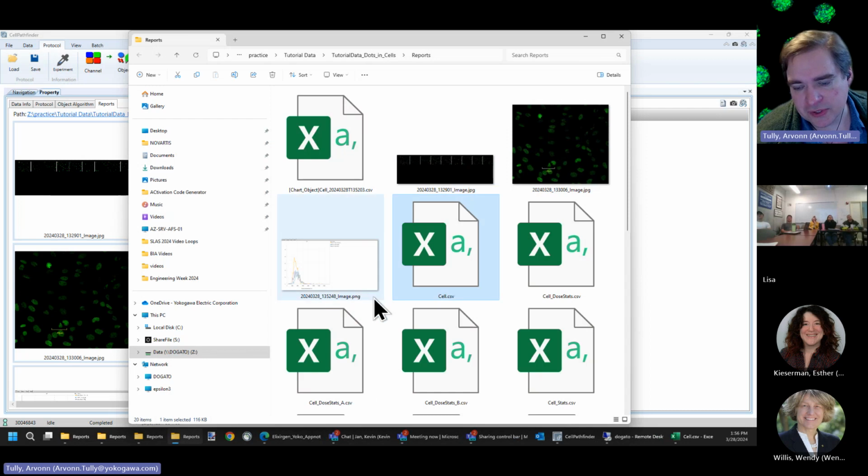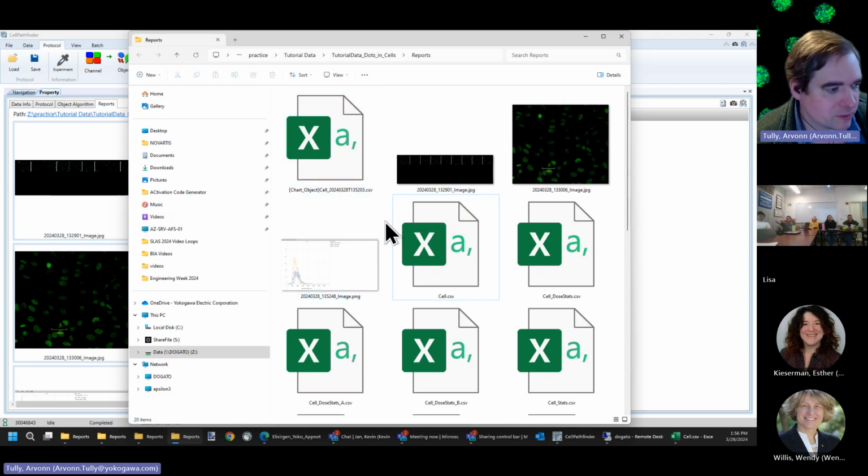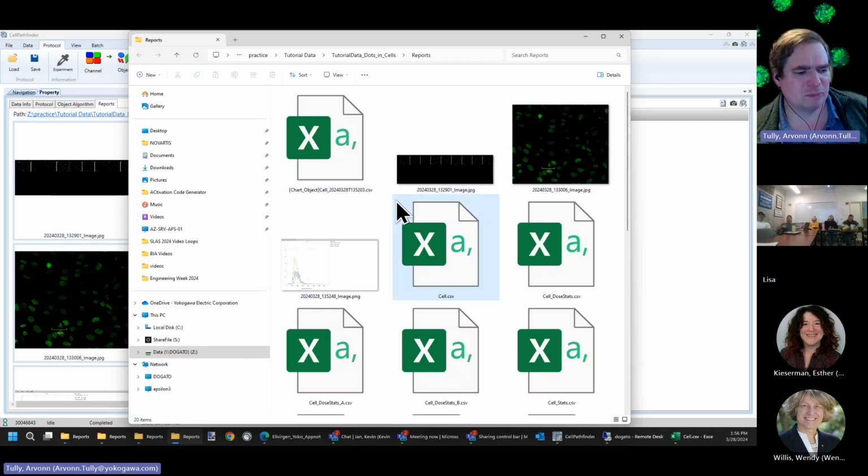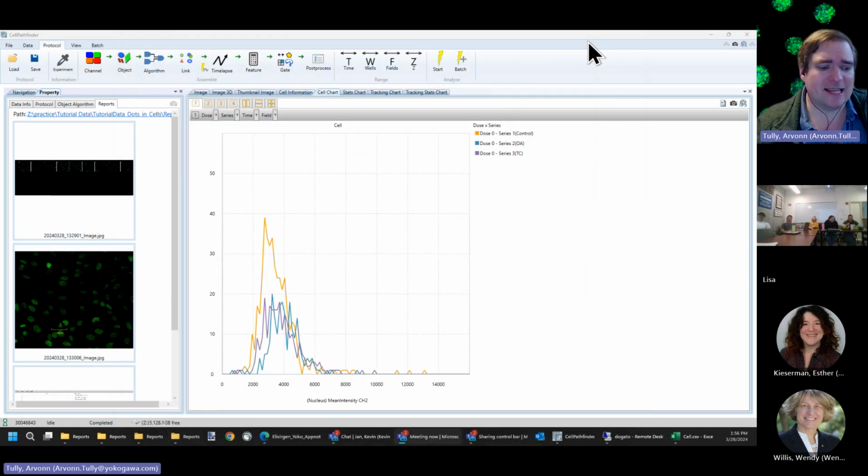Right. So you should use GraphPad or something else, like Statistica. There's a bunch of other graphing software you can use, or if you're into Python, you can do Matplotlib. That's what it's called. It's kind of a pain. I mean, you can do it, but God, why would you? Okay, that's it in a nutshell.